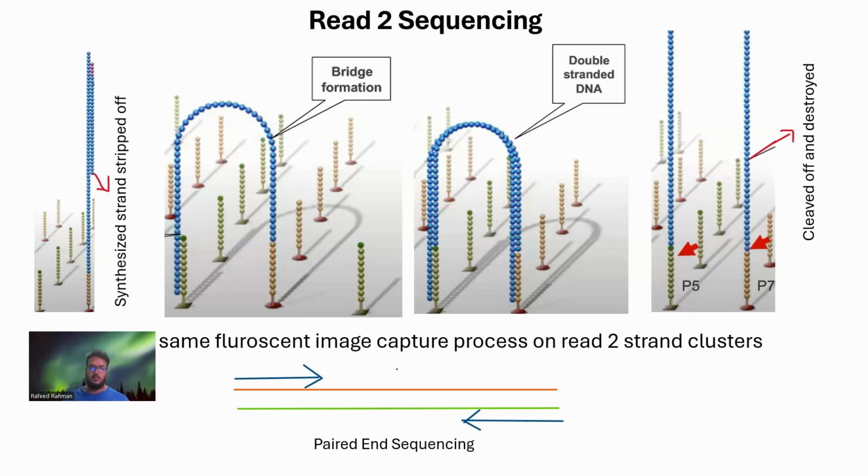One last thing I want to mention is Illumina sequencing, as I said before, mostly works with shorter DNA fragments. It normally cannot work with longer DNA fragments. Why is that? There are two reasons. Number one is that it needs to do bridge amplification, and forming a bridge with a longer fragment, for example a 1000 base pair fragment, is not easy. That process is not efficient enough, so the clusters are very small and the sequencing doesn't work so well with that kind of small cluster.